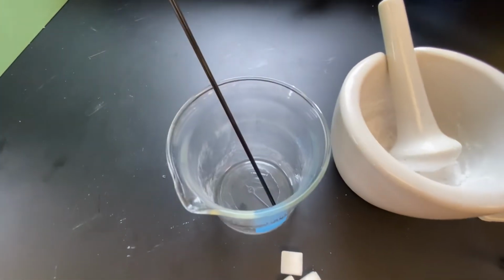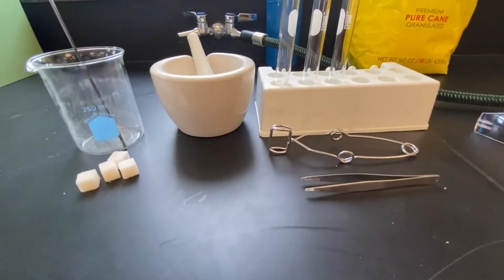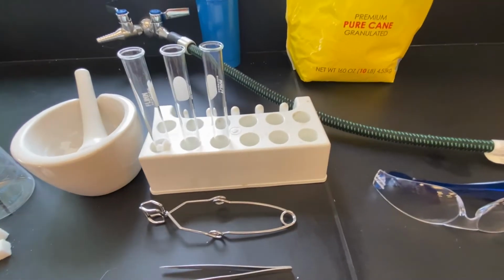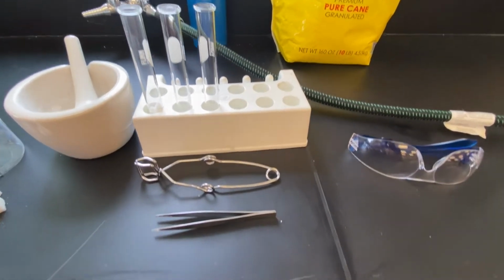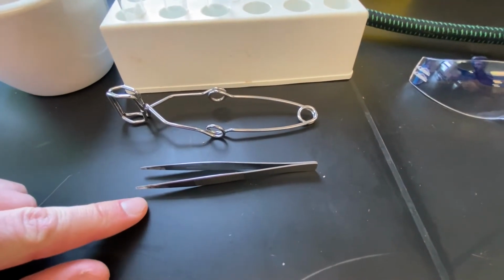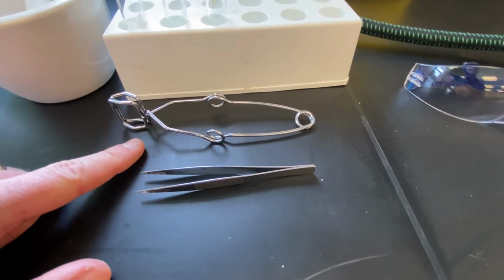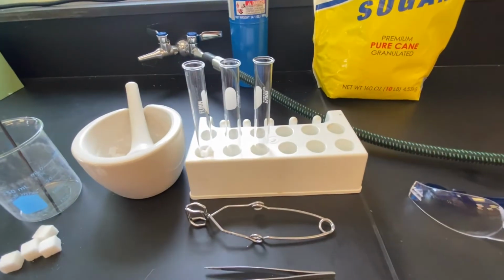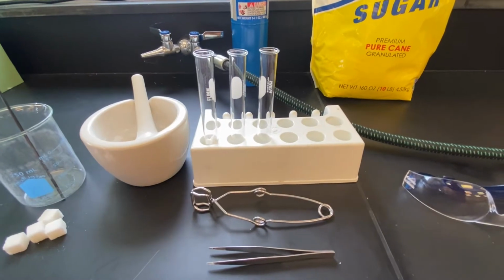Some of the other more basic tools we're going to be using are over here. We're going to be using a beaker with a coffee stirrer in it. This is a mortar and pestle. And then here we've got a test tube rack carrying a couple test tubes. We're going to be using test tubes in addition to these two little guys here. Our first one right below here, these are forceps, aka tweezers. And this is a test tube holder. So basically it's a clamp, kind of like tongs, that I can pick up the test tubes with if they get hot or there's something inside that could burn me.